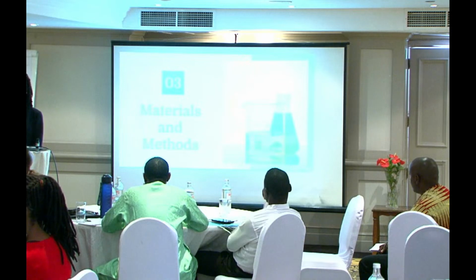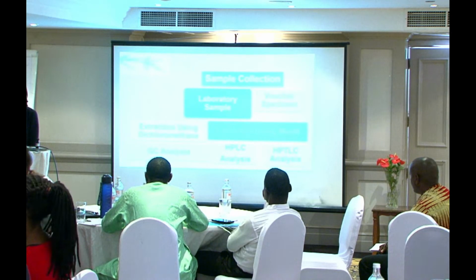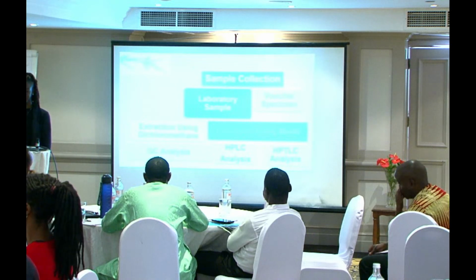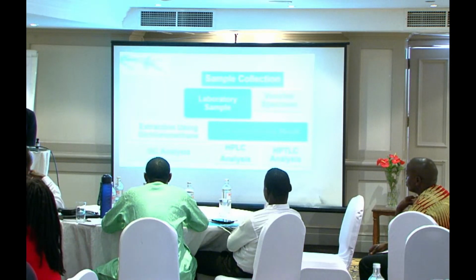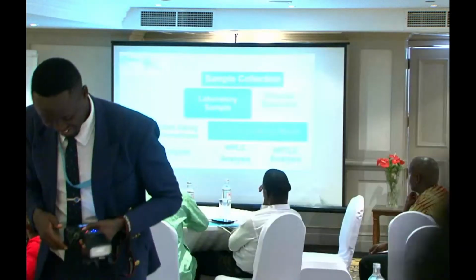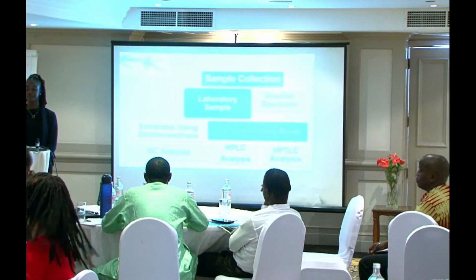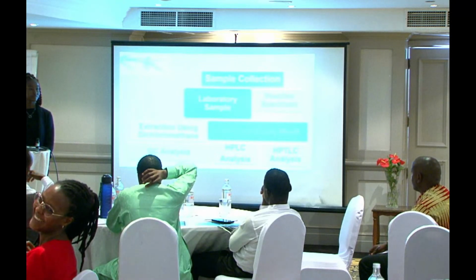So we'll move on to materials and methods, which we all kind of shared. That includes sample collection. We went out to Machakos, but our plant was not found there because it's exotic. So we had to wait for someone to go pick up and bring us back our plants. And we did not get the actual coordinates for those, so we apologize for that.